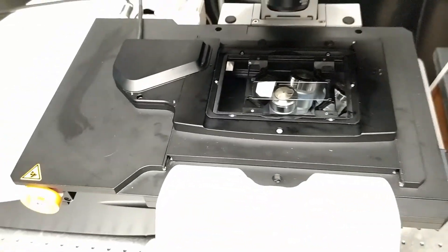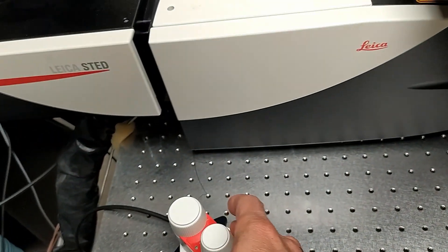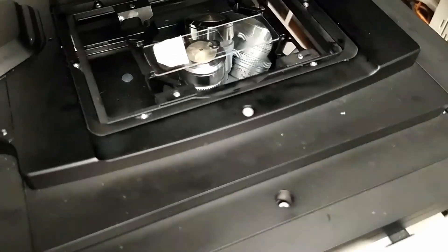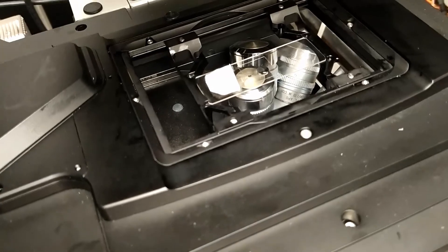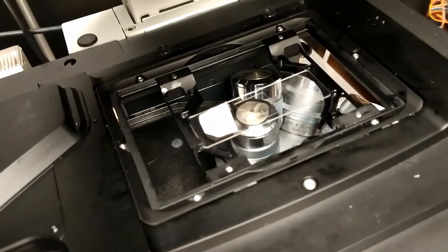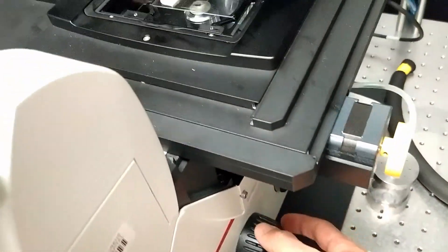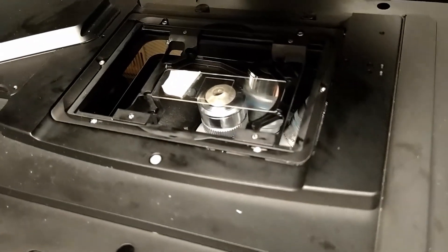Using the joystick, which moves the stage up and down and left and right, we're going to center the sample with the objective. I'm using the drop of oil as a target. Once the centering is done, then using the knob, carefully raise the objective to make contact with the oil and sample.